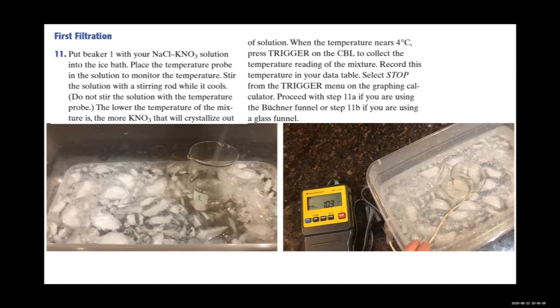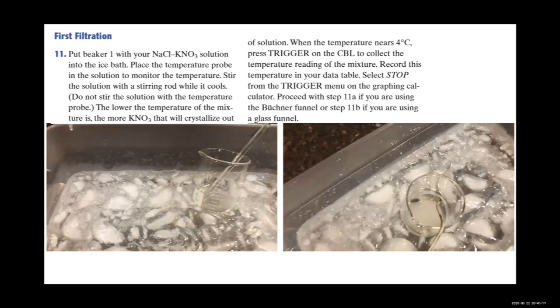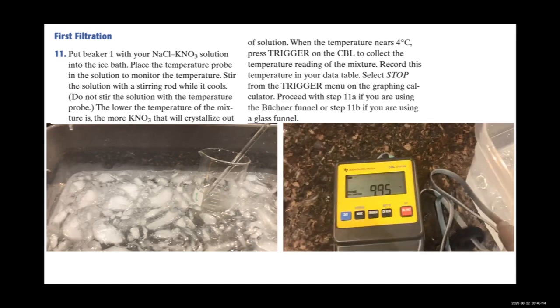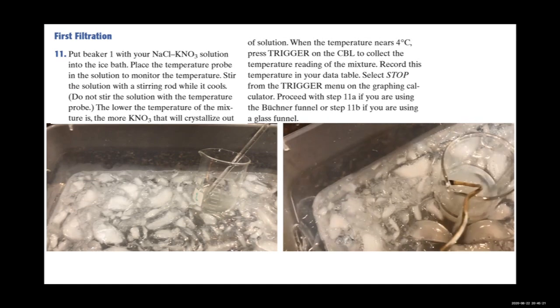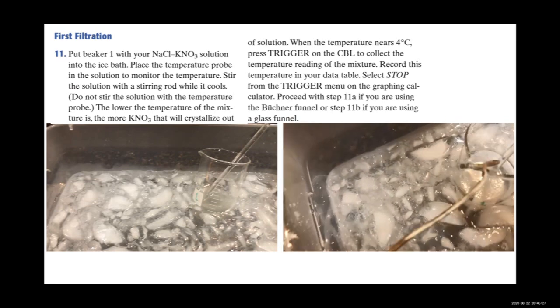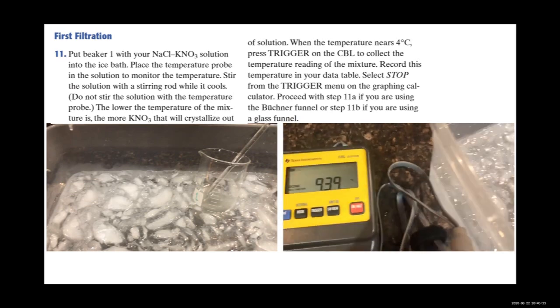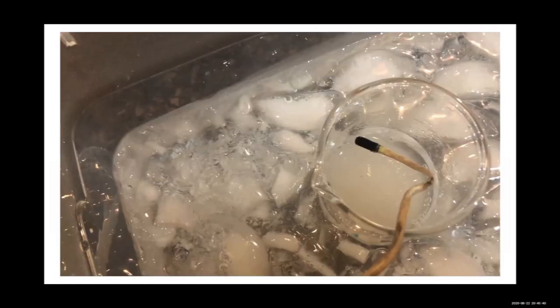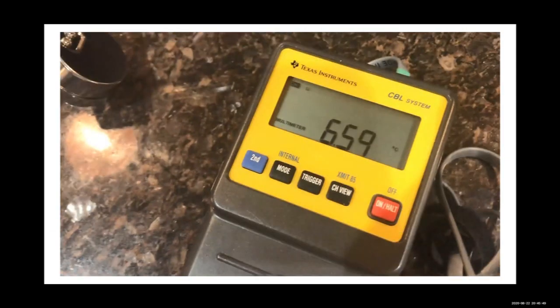Put beaker 1 with the NaCl–KNO3 solution in the ice bath. Place the temperature probe in the solution to monitor the temperature and stir with the stirring rod while it cools — swishing the beaker also helps. Be careful not to stir with the temperature probe. The lower the temperature of the mixture, the more KNO3 will crystallize out of solution. When the temperature nears 4°C, collect the temperature reading.